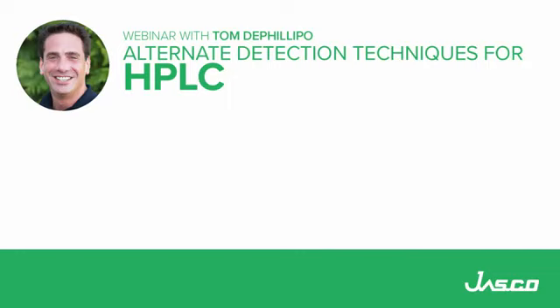Hello, and thank you for joining us today in the next webinar of the Jasco webinar series, Alternate Detection Techniques. And what I mean by alternate is alternate to the most commonly used UV-Vis PDA that you see in a lot of labs today.